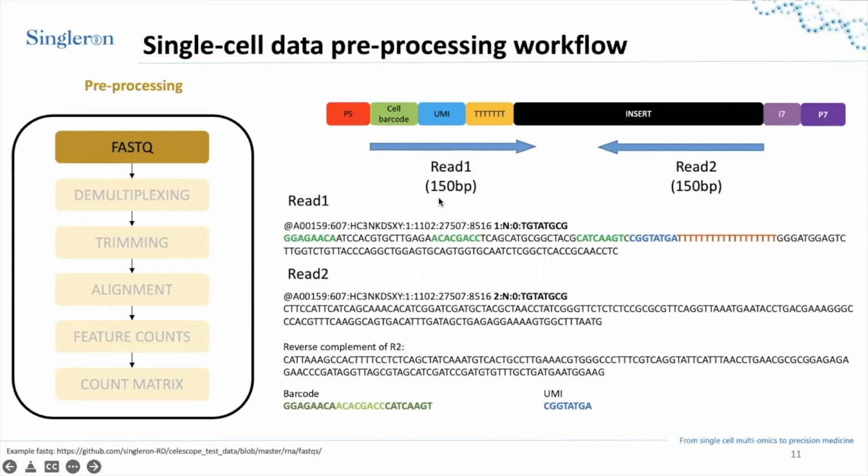Another one is, does the remaining sequence after poly T of read 1 get applied to read mapping step 2, or just skip them? So the read 1 will not be used for the sequence matching.